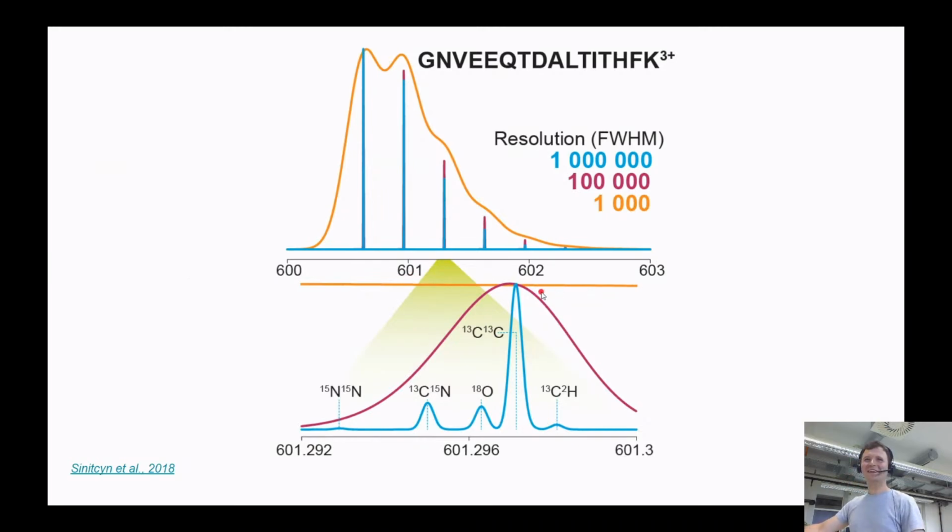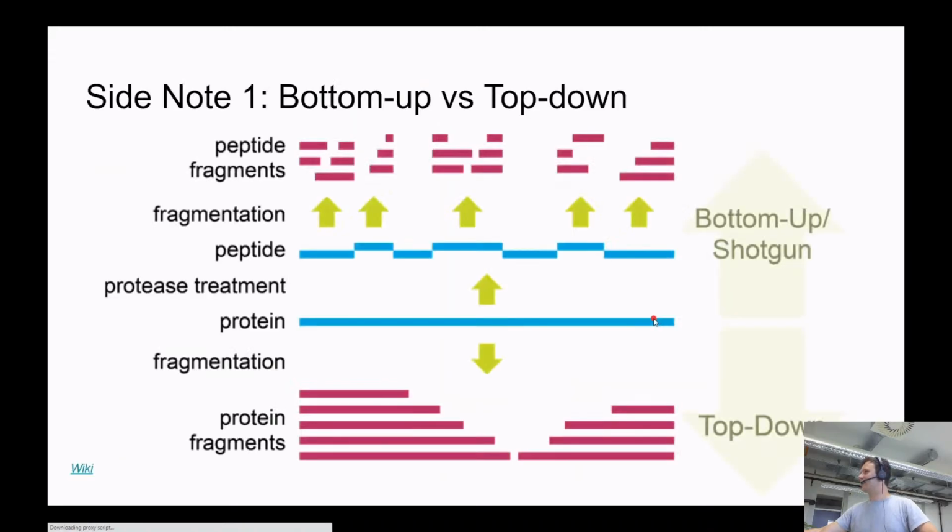The next question which you can ask: how can we use that for some applications? There are some people who are actually doing multiplexing based on this fact, but it's something a bit minor. But you can also do, I don't know, carbon dating of samples. Maybe it can be useful in paleoproteomics. Okay, cool.